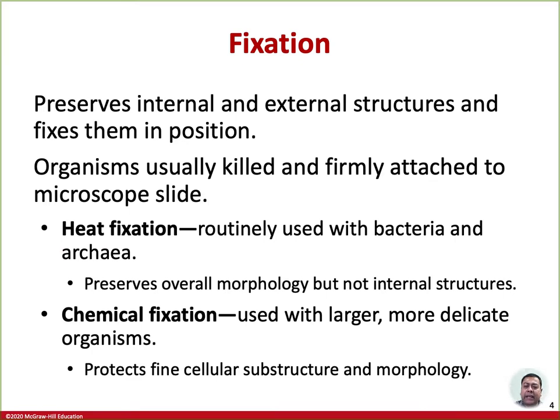It is gently heated, and the heat fixation preserves the overall morphology and inactivates the enzymes. It also destroys the proteins in the subcellular structure, which may distort their appearance as well. The important part is that it preserves the overall morphology, but not the internal structure. This is the most important: overall morphology, not the internal structure.